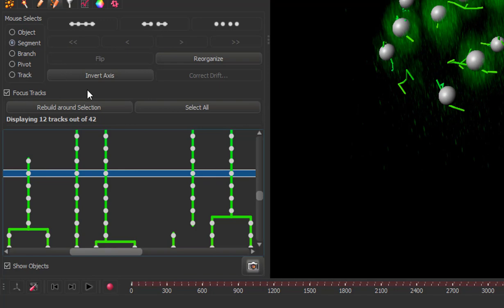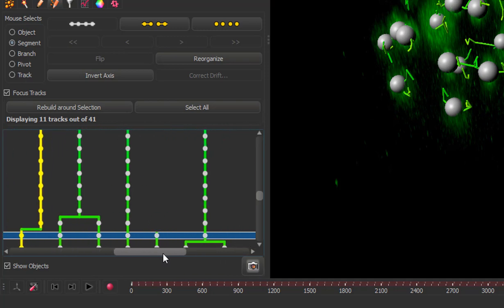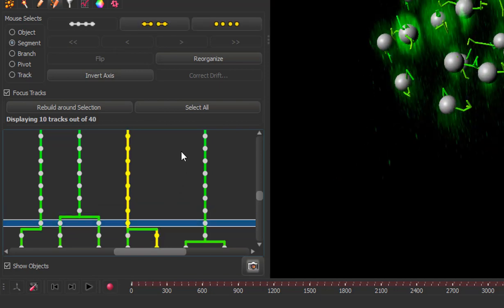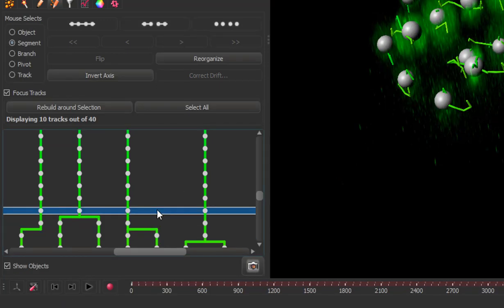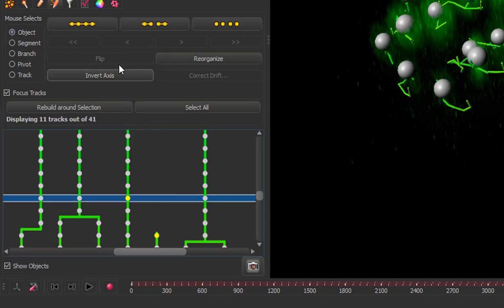If you want to connect two disconnected segments, you can select them both in the segment selection mode and click Connect. Imaris automatically creates a connection between the first object in the segment, which starts later, and an object in the previous time point, which belongs to the other segment. This way, you can either create a straight track or connect a daughter cell to a mother cell. Another option is to choose two objects in the following time points. They can be apart from each other by more than one time point, and connect them.